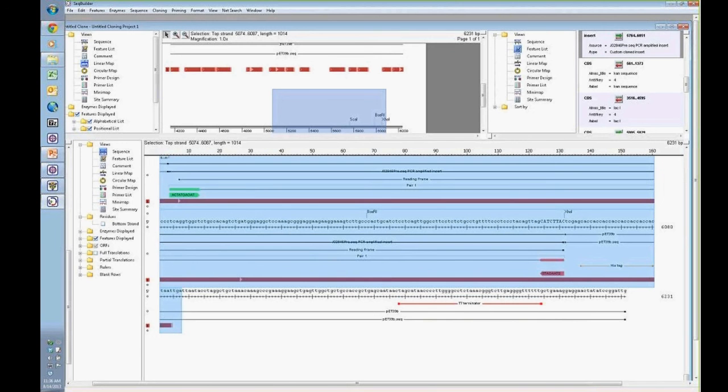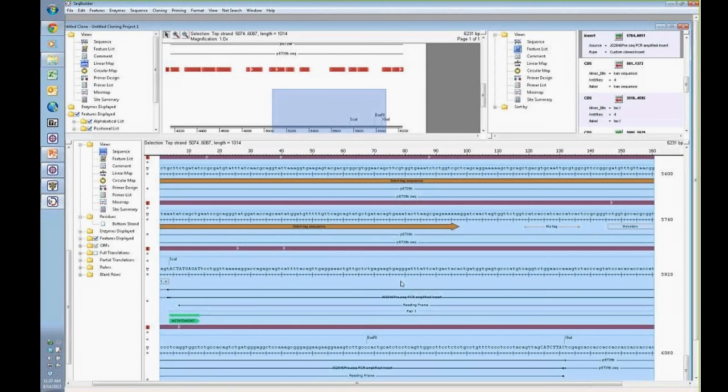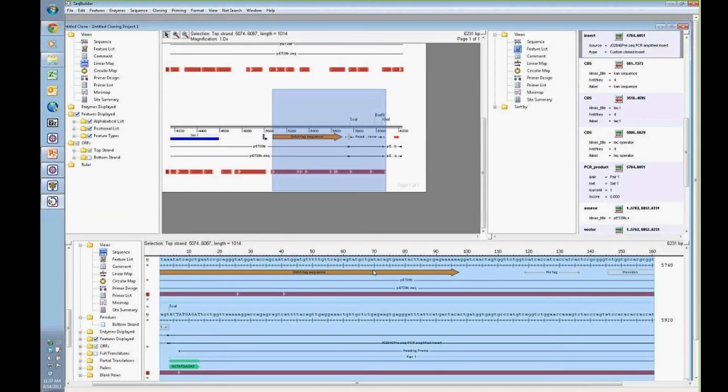It's going to go through the target that I've added, going through the XhoI site, and then there's my terminator at the 3' end. So simply looking at the frame, the open reading frame, that's what this little checkbox is for. A solid triangle identifies that yes, there's an ATG, there's an initiating methionine. This is going to be translating through my target of interest and then terminating at the terminator that exists in the pET-39b expression vector. So I've identified that the frame appears okay, and the next logical step is I can start translating this.